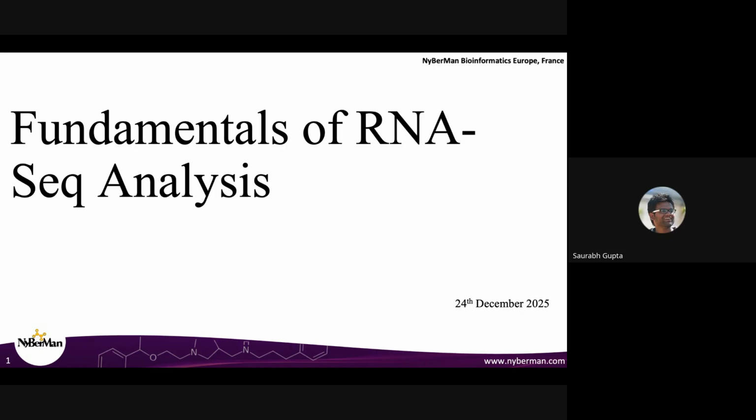Now, we'll move on a little bit. Today I will be talking about a few things in this session. First I'll take you through some of the standard file formats that we use in bioinformatics. Then we will download one data set from one of the public repositories, and work through that a little bit. We will do some sort of QC, and also some trimming. If you remember the RNA-seq analysis workflow, these are some of the steps we will be following today. Depending upon how far we go, we'll see how much we cover in this session, and the rest we'll try to take in the next one, okay?